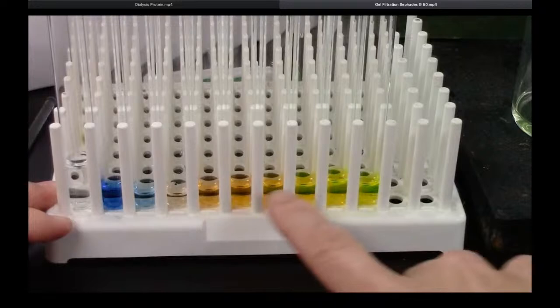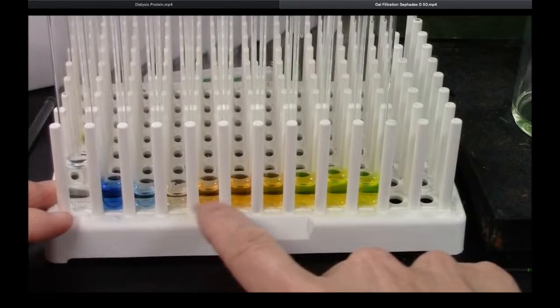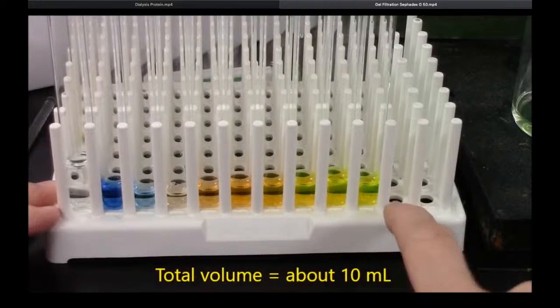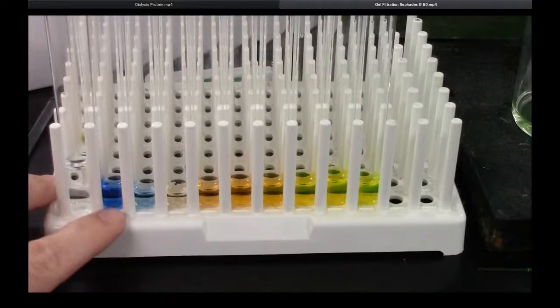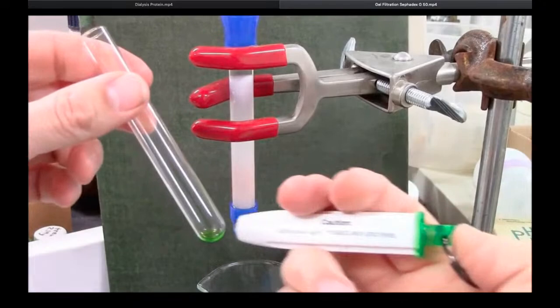So the total volume will be 2.5, 3.5, 4.5, 5, 6, 7, 8, 9, about 10 milliliters is the total volume, which is what I would expect for a column of this size. Often what you want is just this first fraction with the large molecules. If you're trying to desalt a protein or remove the unbound label from a protein, then this is the fraction that has value. These fractions would just be junk. The original mixture, you can see, glows nicely.